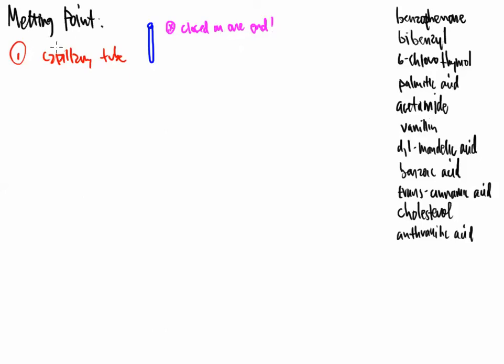What's going to happen is I'm going to take this capillary tube and I'll have a solid lump of crystal that is an unknown — I don't know what it is, and that's the purpose of the lab. What we want you to do is take some of these crystals and put them into the capillary tube. It's so narrow that it will be very difficult to pack the crystals in, and what you want is about a centimeter of crystals at the very bottom of the capillary tube. Less is more.